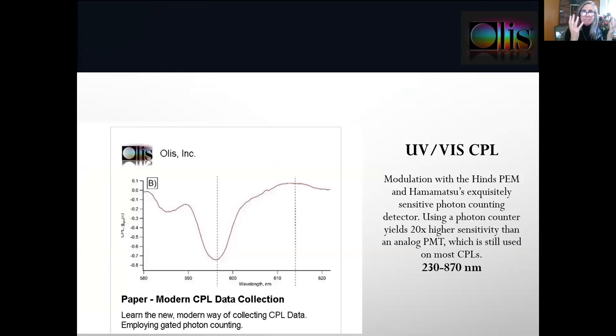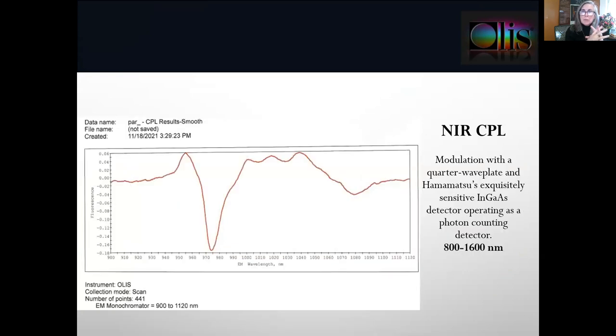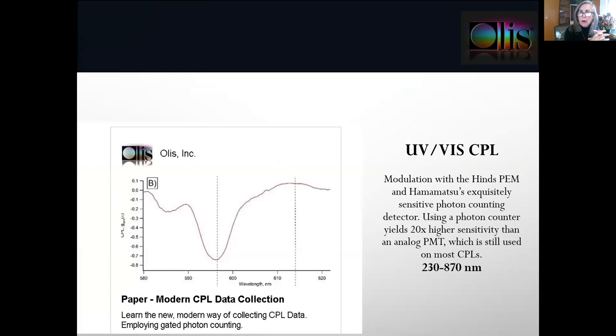Here we have a CPL spectrum in the visible region, using the Hinds PEM modulator and a Hamamatsu photon counting detector. The spectral range of the ultraviolet visible instrument is 230 to 870 nanometers. The excitation wavelengths are coming from an LED, so you can choose pretty much any wavelength you like for excitation.